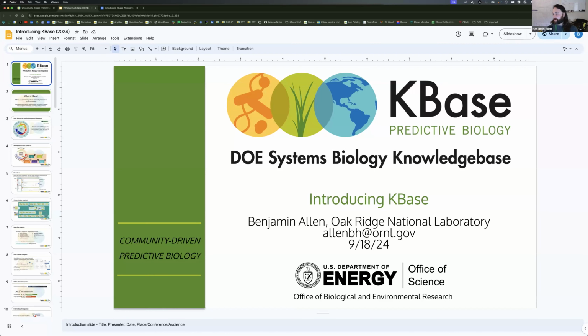And yeah, I hope by the end of this, you'll get a good sense of what KBase is, how as a platform and as a scientific project, as well as what you can do with the platform and the tools and the data inside of the platform to allow you to drive your research and analysis and access some of the power that's available in the platform to you all. So I'm going to go through a couple of quick slides here just to give some context for what the KBase project is.